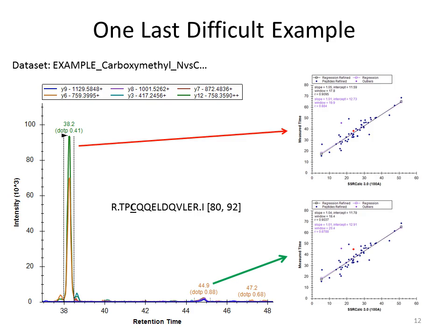So when given the choice between the big tall one and the bottom one, obviously dot product is showing us that it's kind of leading the way here. However, this small one, even though it's got a great dot product, if you pick this peak and it applies that retention time to the plot, it's up off the line. It's more of an outlier. But if you pick the big one with the smaller dot product, it's closer to the line. However, I don't like this one because that blue signal is right at the baseline. There's nothing. It's a flat transition.